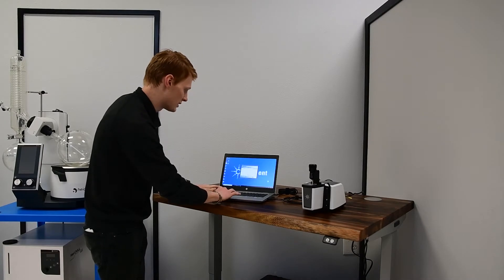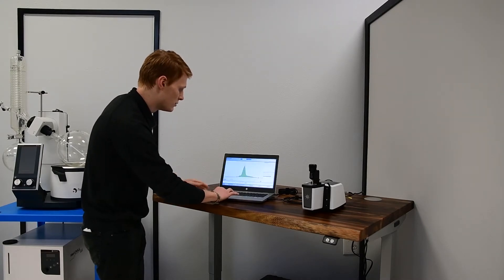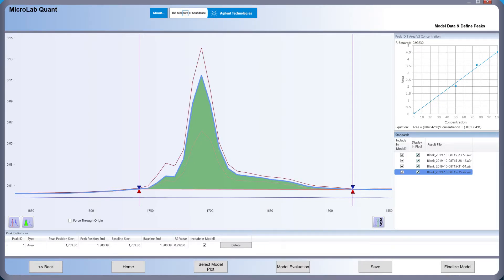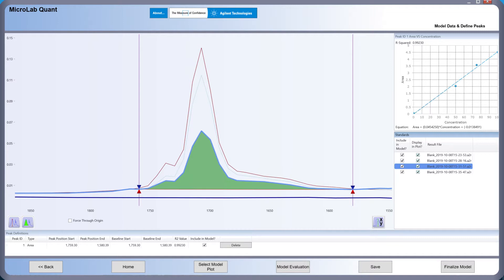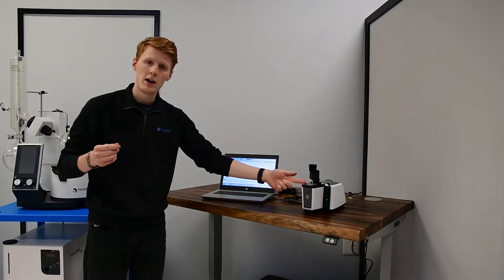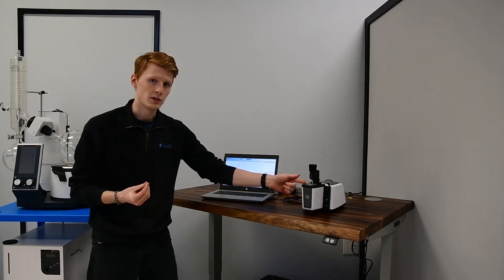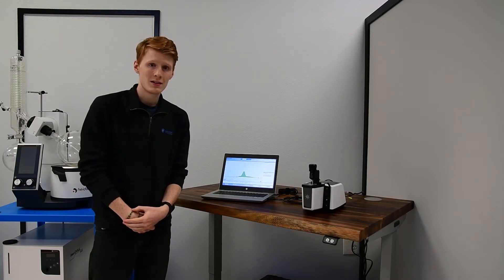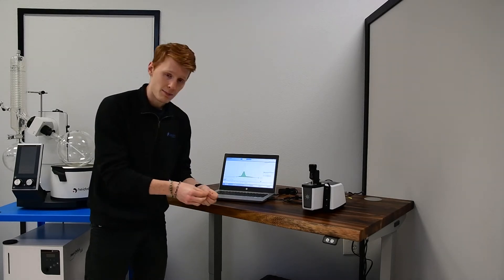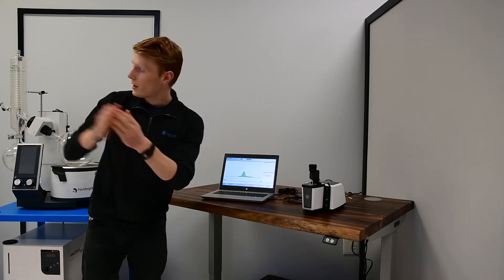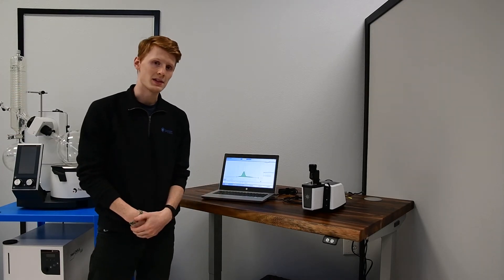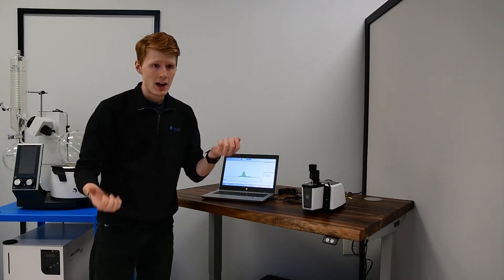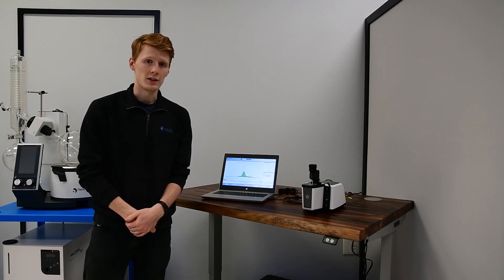By taking a bunch of different scans of different concentrations, you can build a chart with high concentration, medium concentration, and low concentration — essentially make a line — so that when you put a sample of unknown concentration on here, this will tell you exactly what its potency is. By identifying that potency, you can reapply it to the parameters used on your Pure Path system so you'll know exactly what is in your heavies, what is in your lights, and whether or not you need to rerun your distillation.